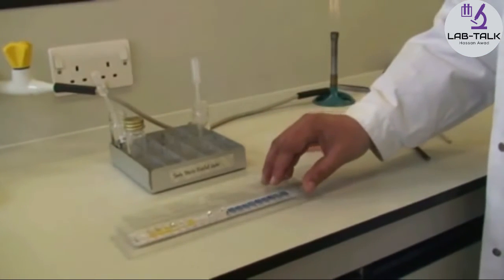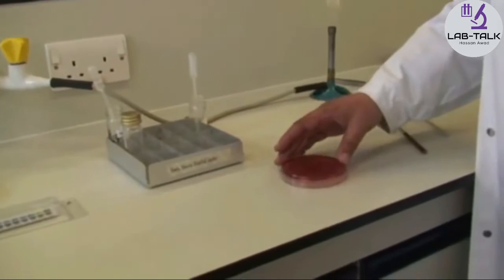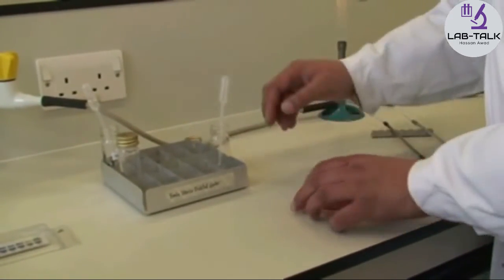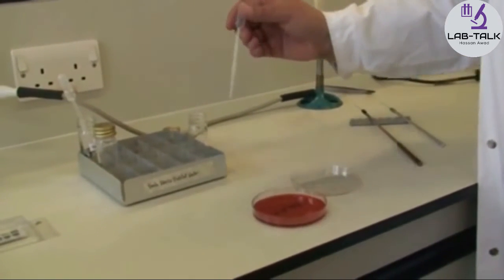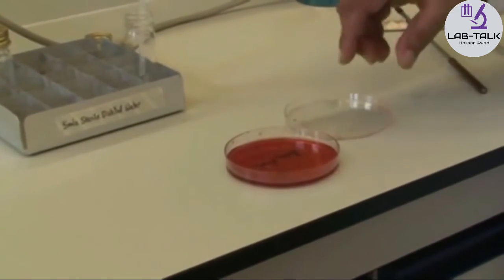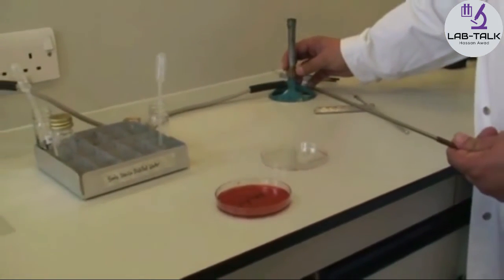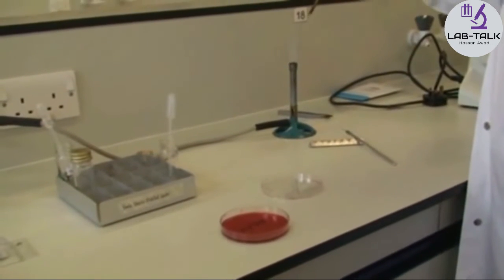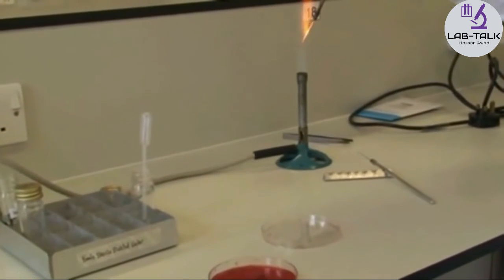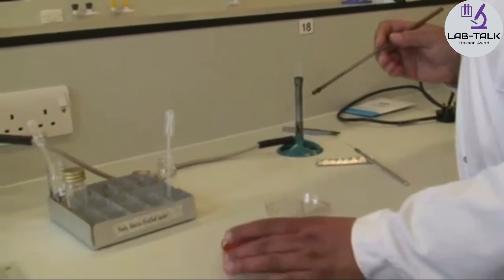Pop the lid back on so you don't contaminate with environmental bacteria, then do a purity plate with your bacterial suspension just to make sure what you've put in is pure. Take one drop and drop it on the agar plate. Using your bacteriological loop in the hottest part of the flame to sterilize it, then streak out that drop across the plate so that next time you can see nice single bacterial colonies.